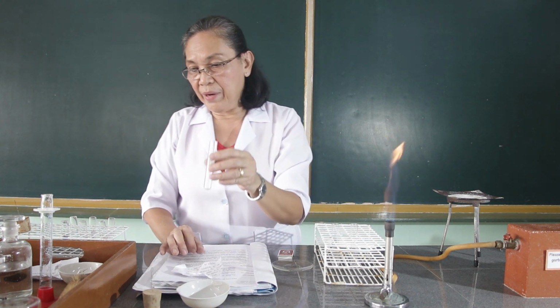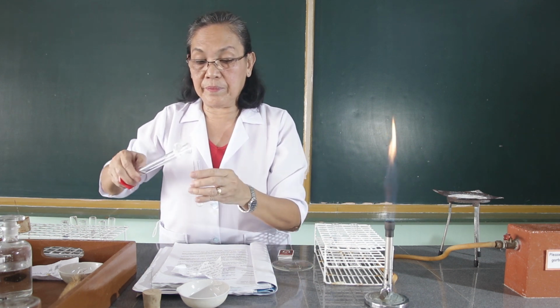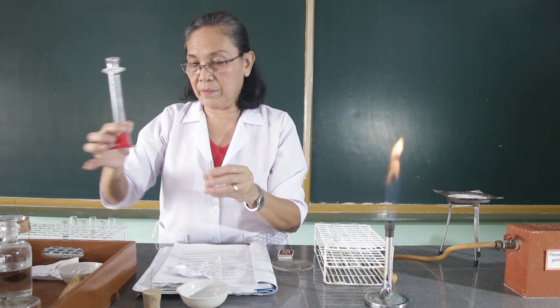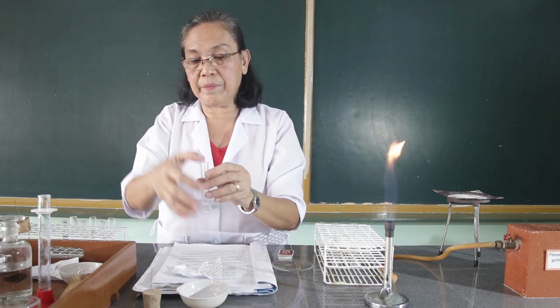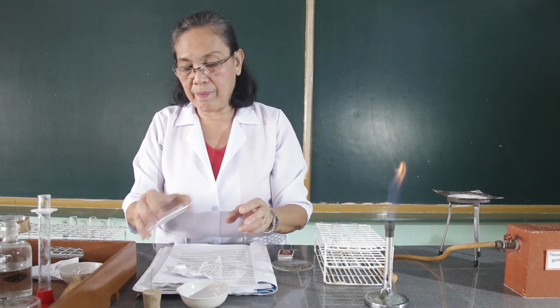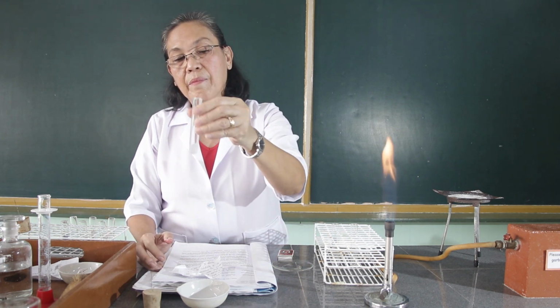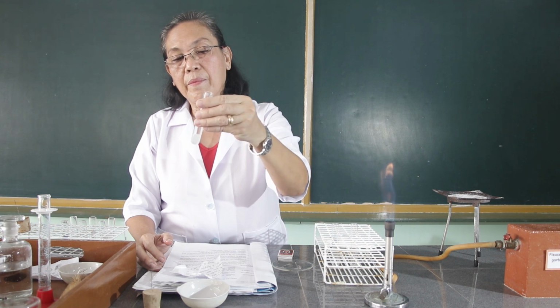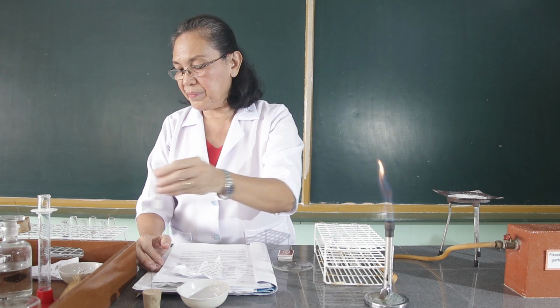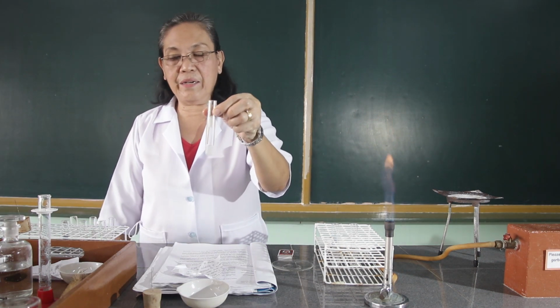Then to this, we're going to add 1 ml of water. Then, to this mixture, we're going to add hydrochloric acid.